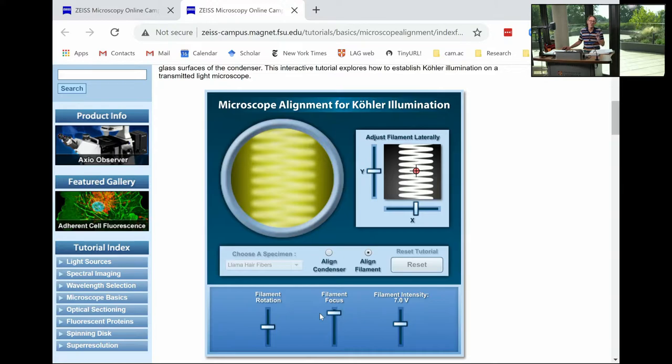Today, almost universally, people now start using light-emitting diodes. I should say that many microscopes you still have in laboratories have these filament light lamps in them. But more and more now they're replaced with optoelectronic devices.